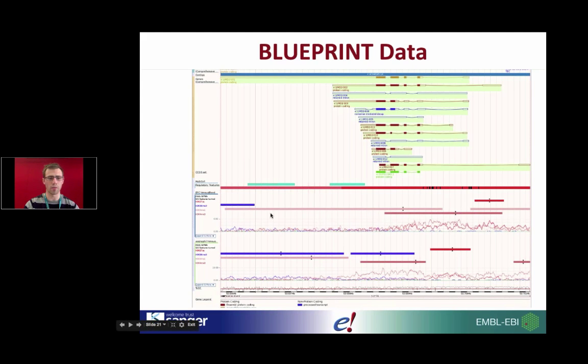You can see for the EPCs, there's a number of histone modifications that have been identified in this region in detail view, and the same for eosinophils. You can see a number of different histone modifications that are annotated to this area of the genome. And so this is the peak, and this is the signal for each of these histone modifications, which have given rise to the annotation of the regulatory feature in each of the positions here for the cell types.